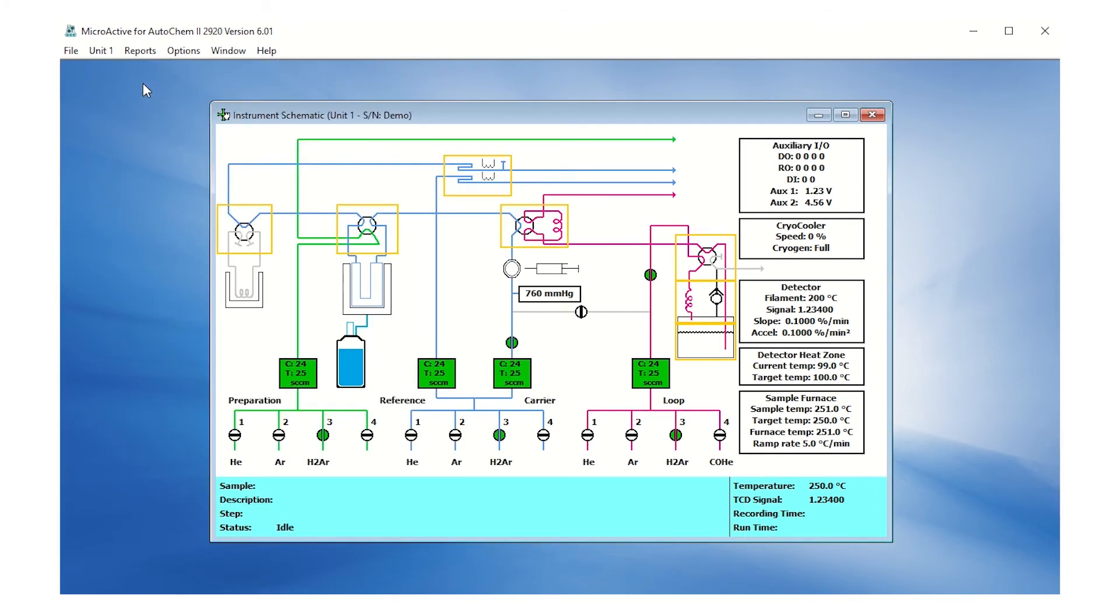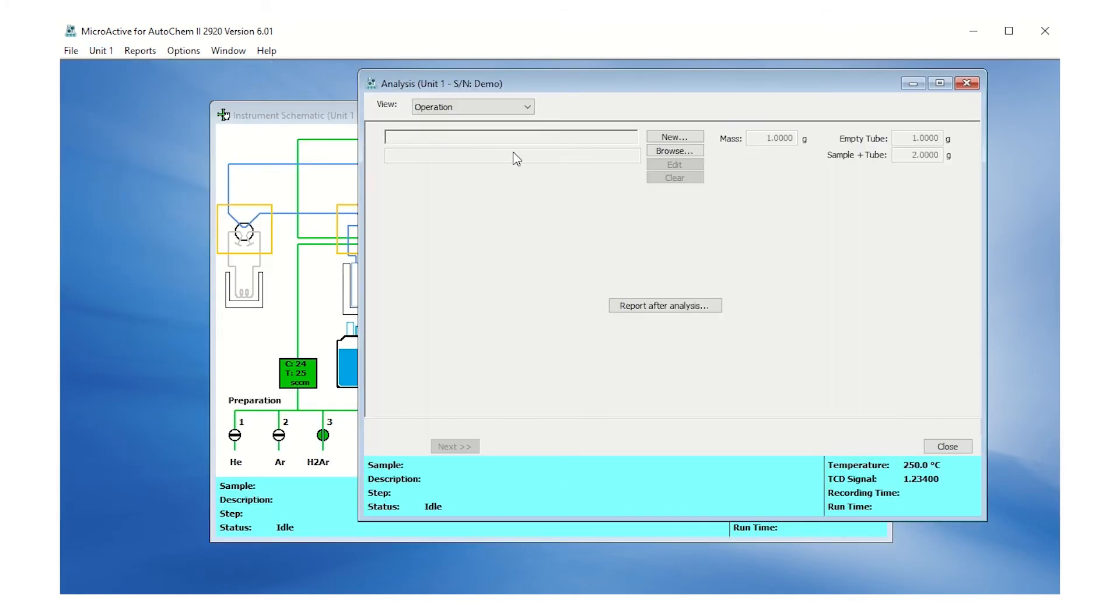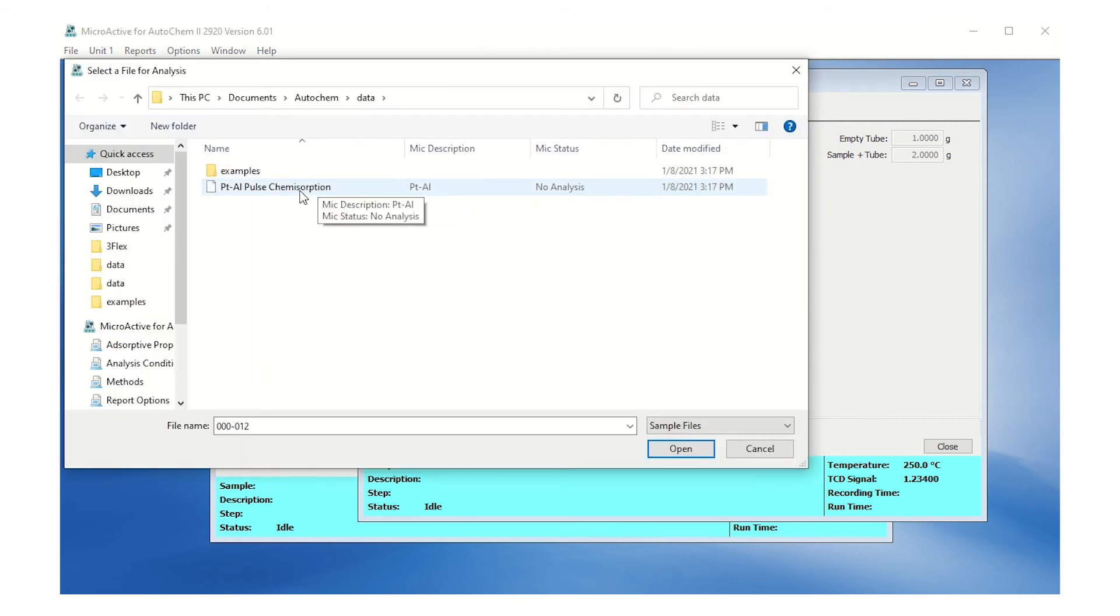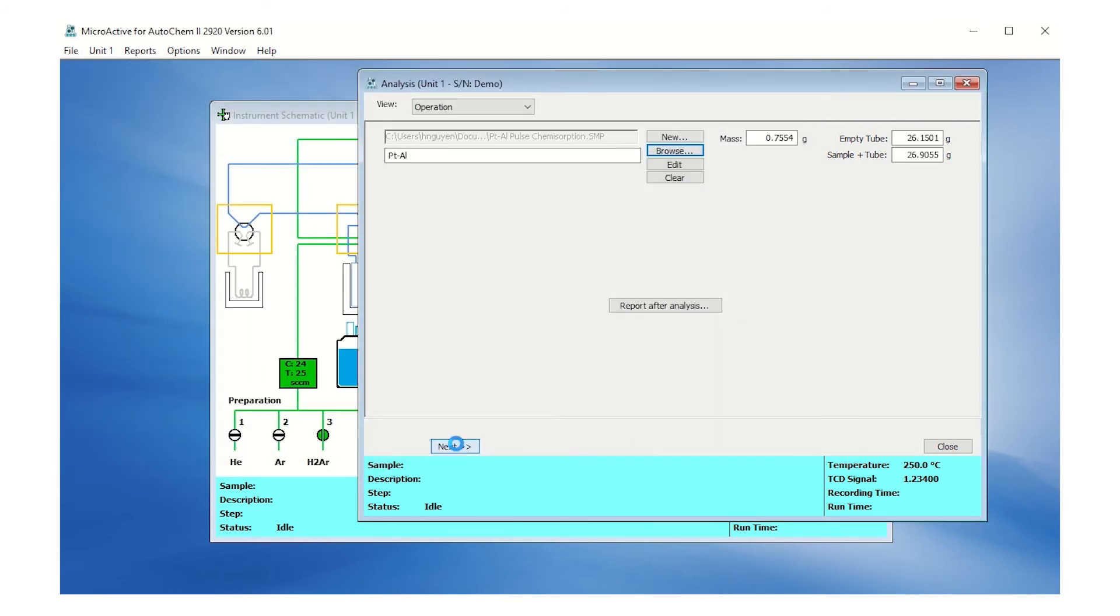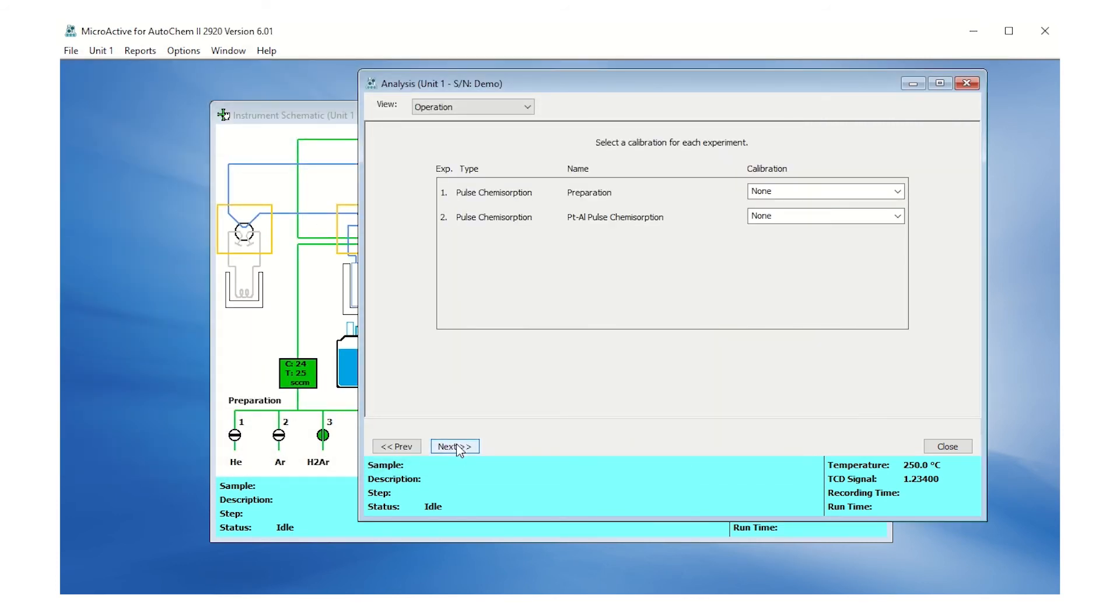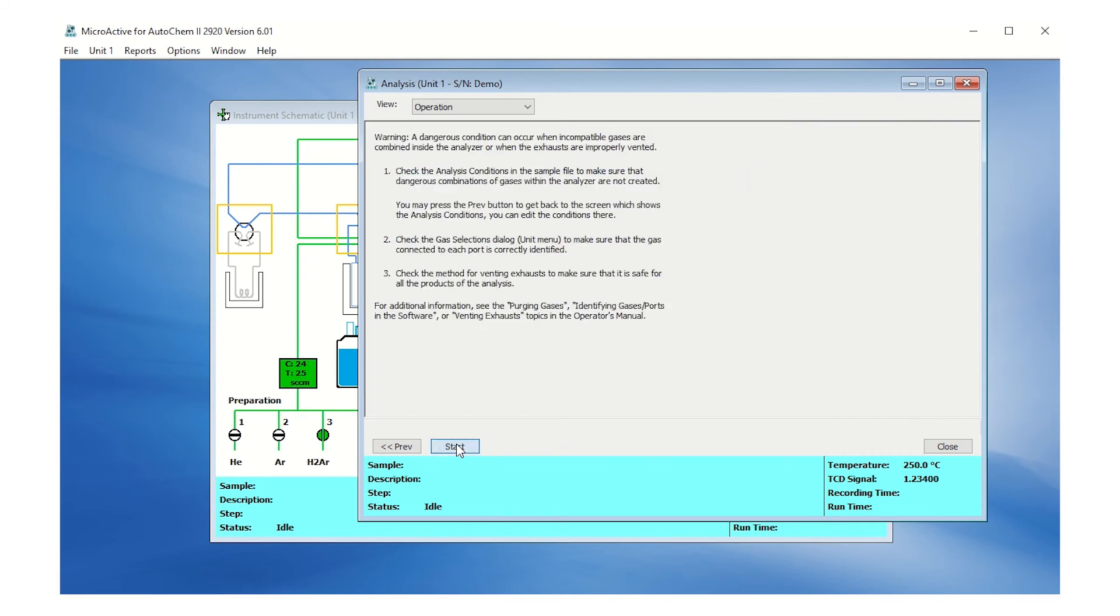To start the analysis, click on the Unit menu, Sample Analysis. Load the sample file and then click Next. No calibration files are needed on this screen. Click Next. Click Start to begin the analysis.